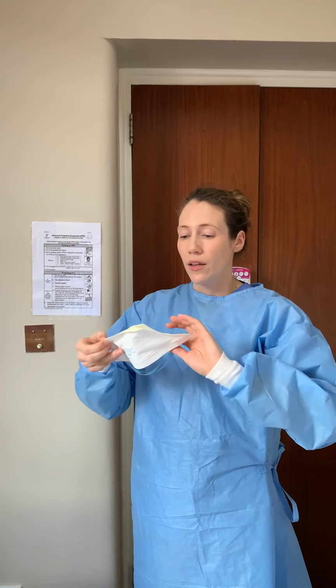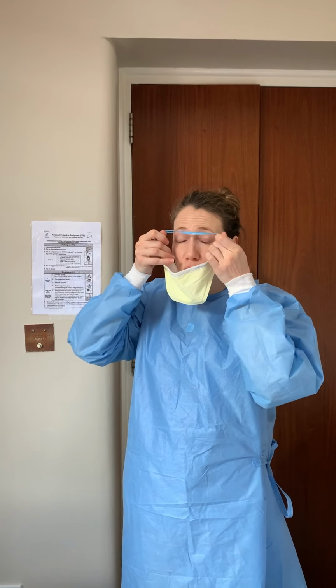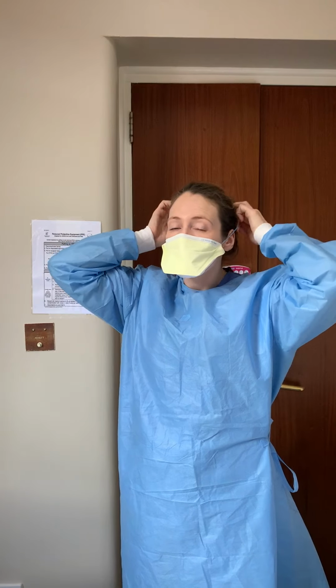In order to put on the respiratory mask, you don your PPE in the same fashion as you would, but replace the surgical face mask with one of these masks. In order to fit it correctly, you need to bend the nose piece to allow the straps to fall out. Then, holding onto the straps, you place the chin against the chin piece and bring them up and over your head. You can see at this point I don't have an adequate seal, particularly around my nose.